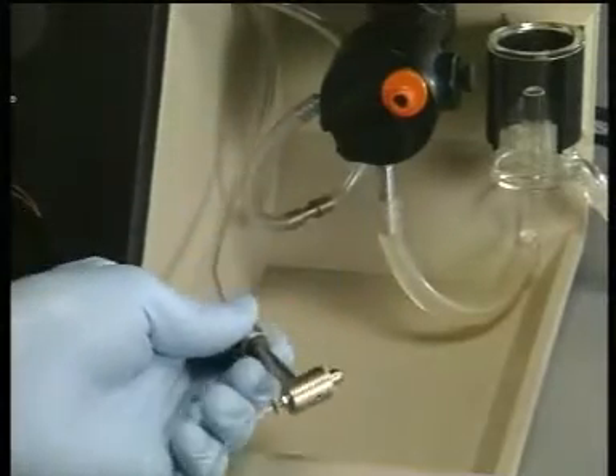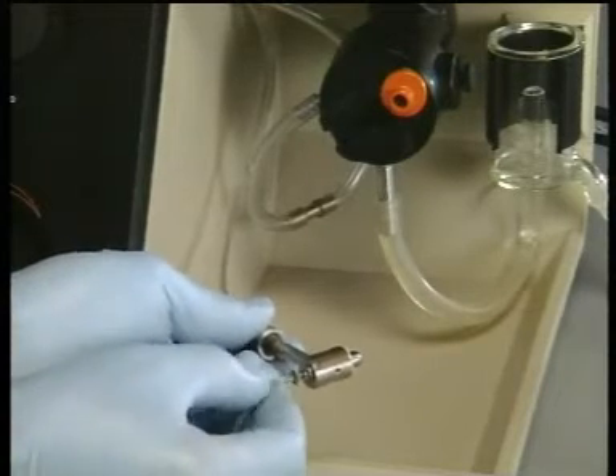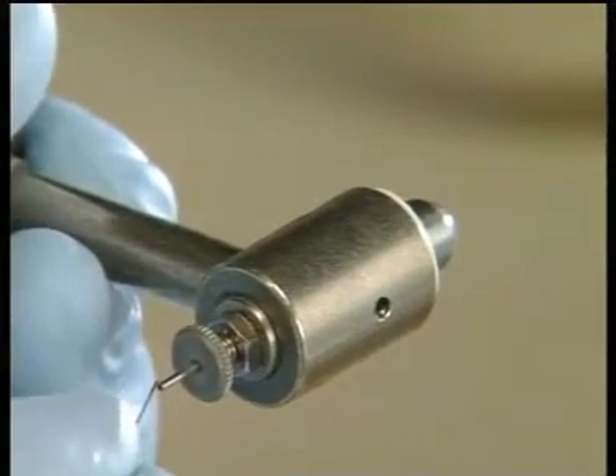This can be done by removing the nozzle, taking off the delivery tube, and passing a fine wire through the nozzle.